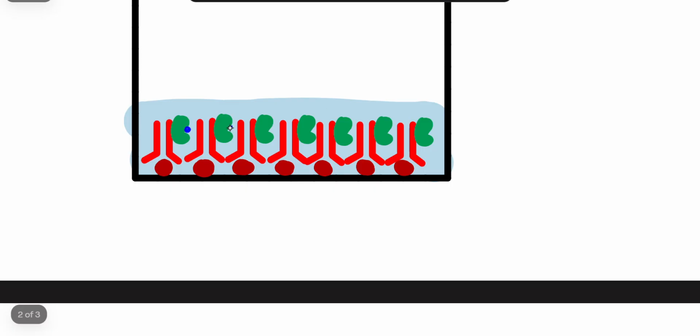Here I have added the substrate, here, and here. As I have added the substrate, it has bound to its own particular enzyme. And what do I see? After a certain period of time, I see that color has been produced here. So this is the case where I can clearly say that the antigen was present. Because the antigen was present, the antibody has bound to that antigen, and because it has bound, the substrate bound to the enzyme. Even after washing, because the color did not go off, that definitely means there was antigen present. So this is a direct form of ELISA.